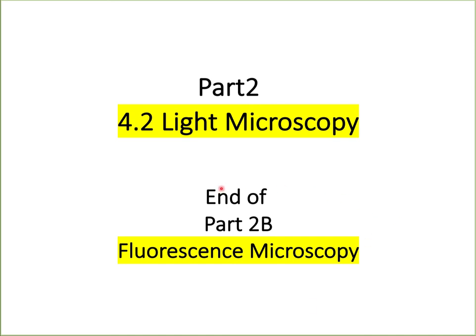This will be the end of part 2B, which is fluorescence microscopy. In the next part, we are going to talk about different types of modified fluorescence microscopy, including confocal microscopy, 2-photon microscopy, and several others. So this is the end of part 2B, fluorescence microscopy.